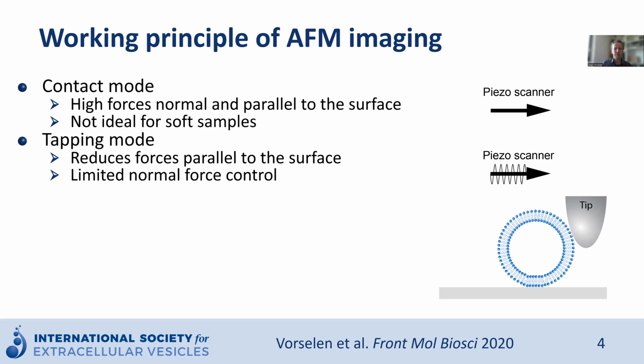Another operation mode is tapping mode, and this one is more frequently used for soft biological samples. In this mode, the cantilever is oscillated close to its resonance frequency using a piezo. And the interaction with the surface will actually affect the amplitude of this oscillation. So in this mode, instead of maintaining a constant deflection of the cantilever, the amplitude of the oscillation is kept constant.